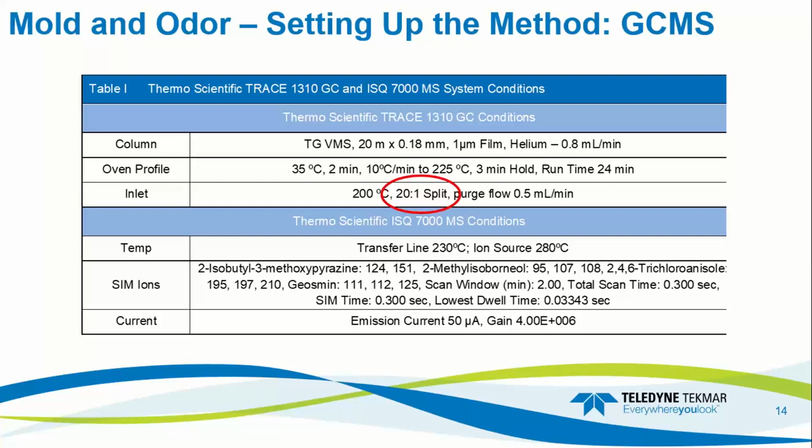With this method, we want to lower our split ratio to put more of those compounds onto the column, allowing for more of it to make it to the mass spec. As long as we are getting good recovery and area counts that adequately calibrate, and we're seeing a reduction in water from our other parameters, what we have selected should be all right to lower that split ratio.